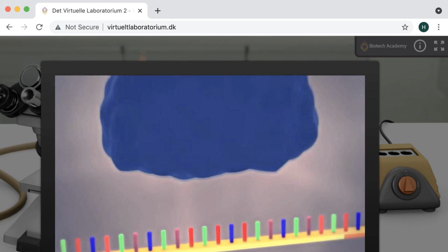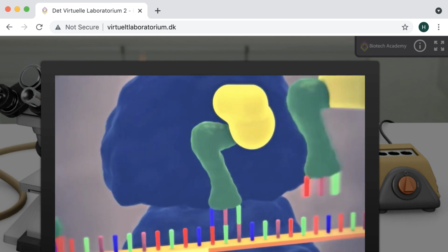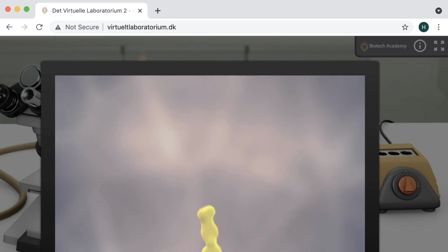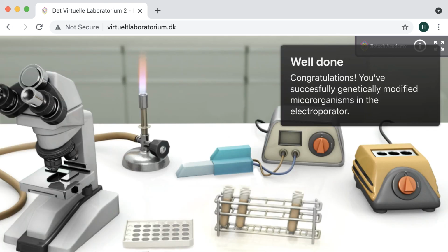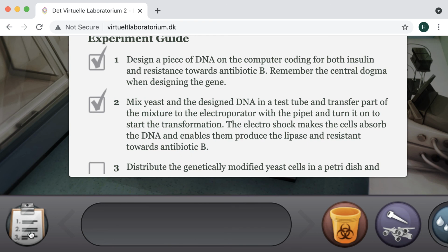Next, the messenger RNA is translated. The ribosome assembles around the messenger RNA. The protein is assembled one amino acid at a time. The protein folds to its three-dimensional shape. At the end of the movie, the platform says one has successfully had the organism make the proteins. Back within the main lab, select the guide. This is where the high school assignment will end. Student scientists have essentially completed everything they need for this to be illustrative of DNA to protein curriculum.